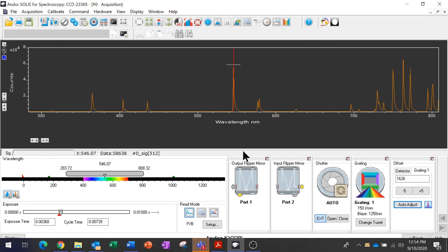There's a grating offset that's per grating again. So now if I go to this grating, it's going to be a different offset that I can then update. Or were I to say remove the camera, put it back on, and it goes on 25 microns to the left or something, which is certainly within the tolerance of some screw holes, then I would apply this offset that should keep me from having to manually update each grating's offset. So that's the general idea.